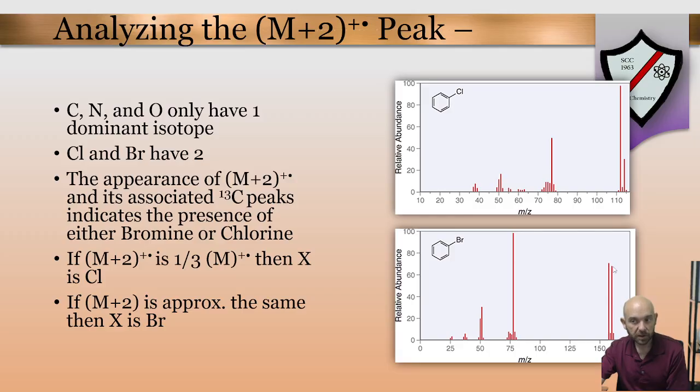If there's a molecular ion peak and a molecular ion +2 peak that's much closer to 50-50, then that's always a bromine. We can see the bromine here. We know there's a bromine in that molecule because the two isotopes of bromine are much closer to 50-50, so it's about equally as likely that either isotope of bromine is found in, for instance, this molecule here.